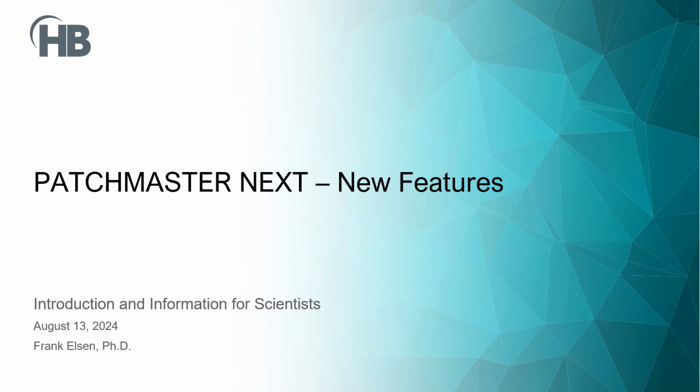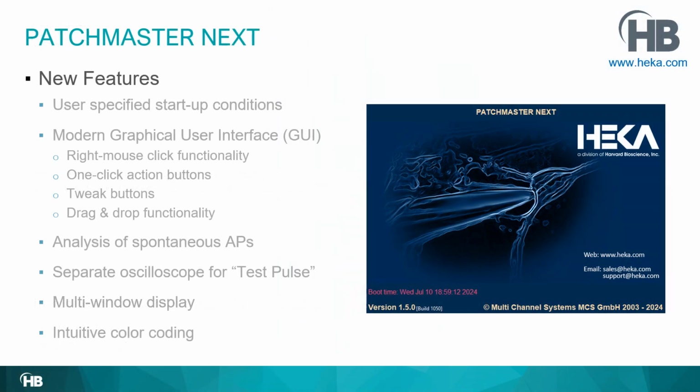This video is about the new HEKA software PATCHMASTER NEXT. It is about the new features of PATCHMASTER NEXT, so I will not explain all the details of PATCHMASTER NEXT in this video. Here's an overview of what's to come, so please feel free to step ahead.